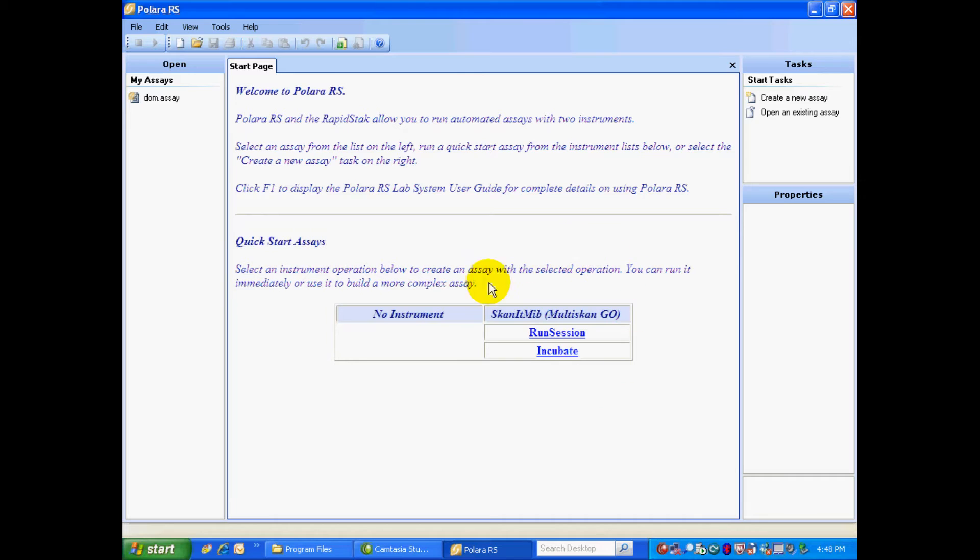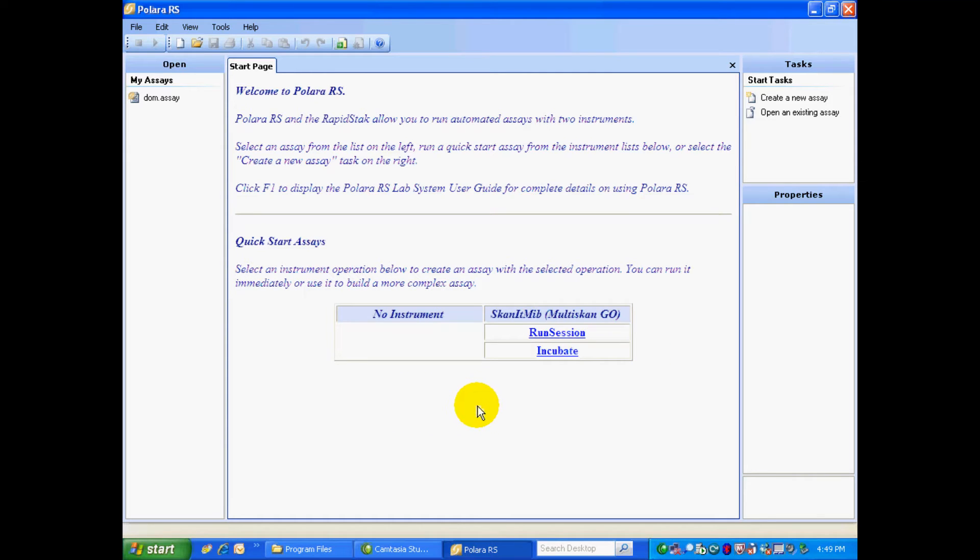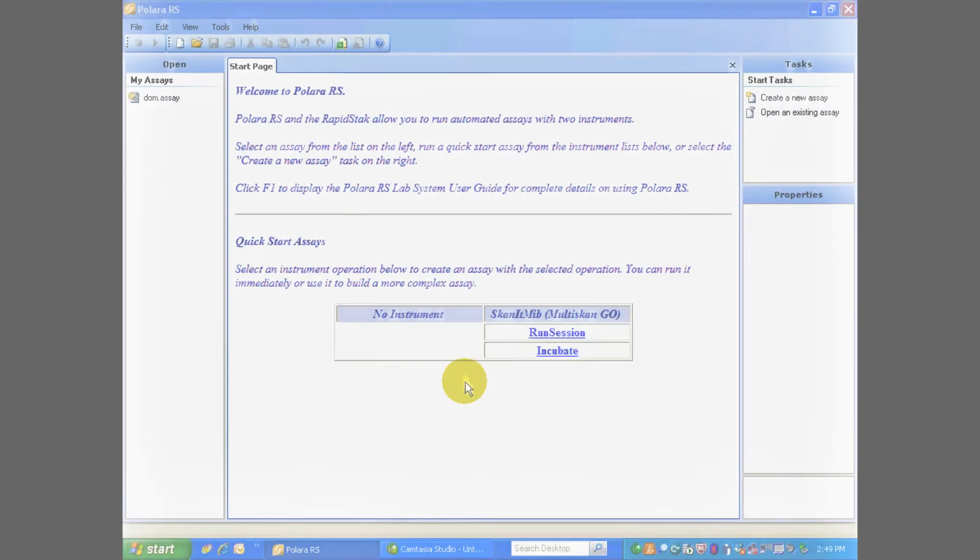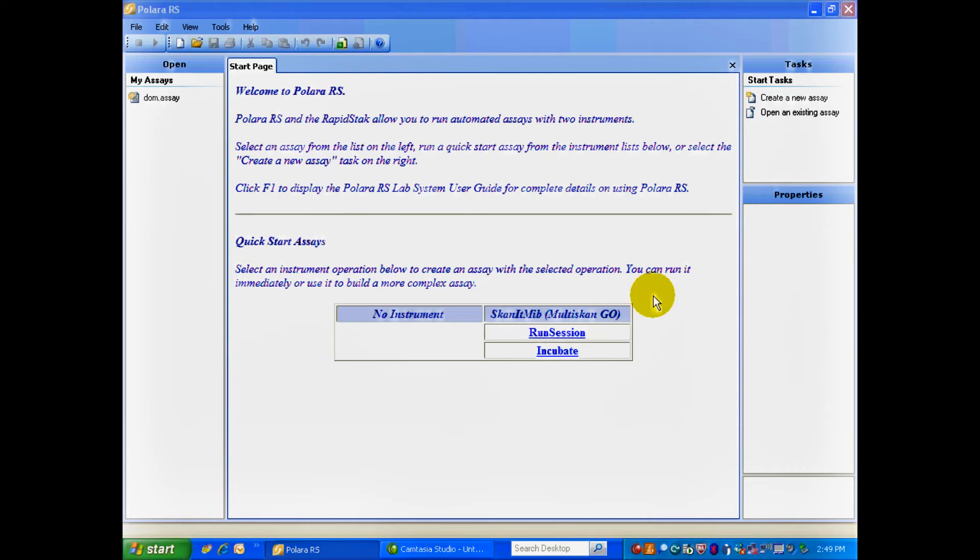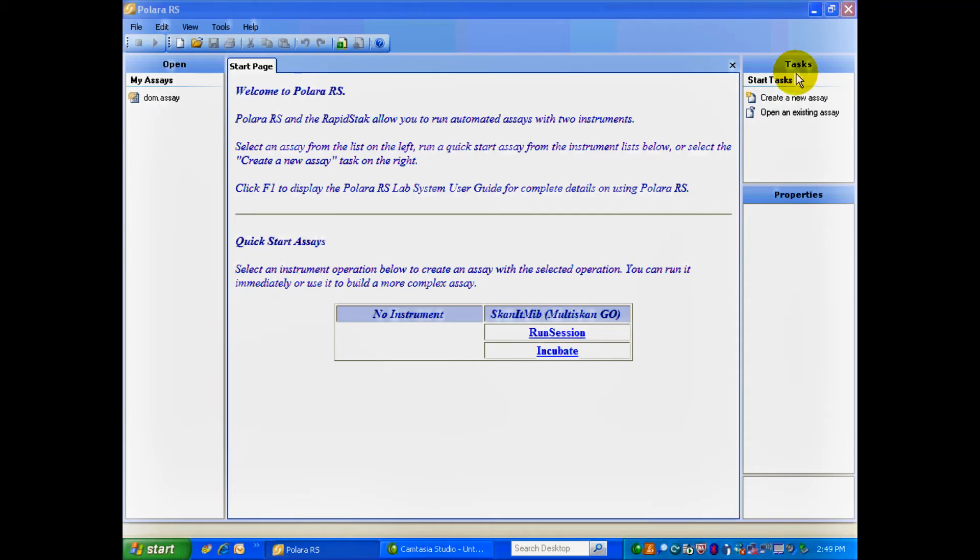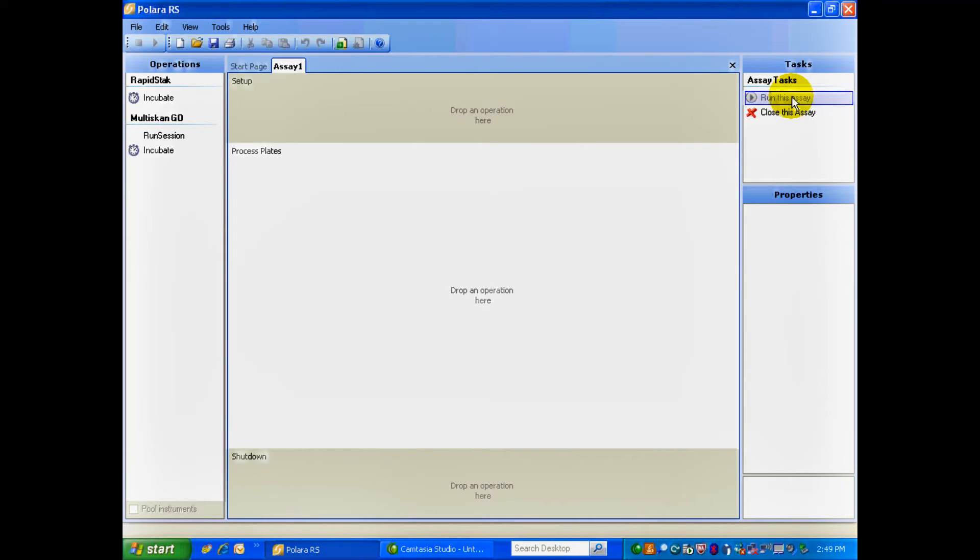And as you can see, I've added an instrument to my setup. So now, we're ready to create an assay. Now that we've installed the instrument driver, as you can see on the right, ScanIt for the Multiscan Go, we're going to start building our processes. So in the upper right-hand side, under Tasks, you'll just select Create a New Assay.